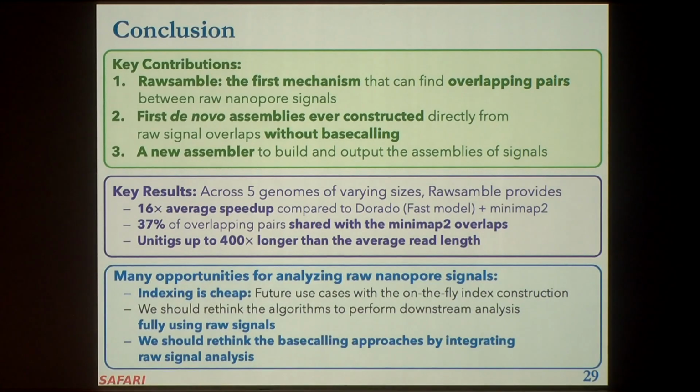And we believe that there are many opportunities for analyzing raw signals. For example, we should rethink the base calling approaches by integrating the raw signal analysis information.